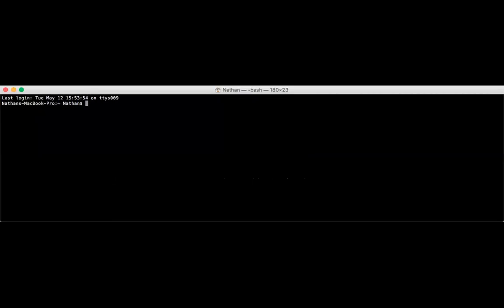Terminal. So we are going to log in. Again, use your username to do it. Your password.